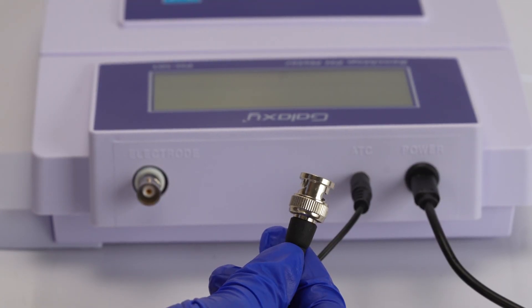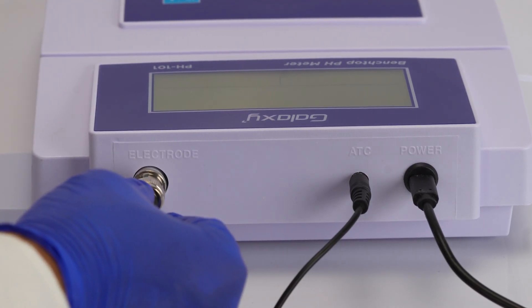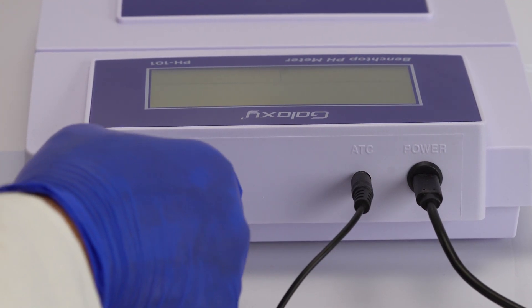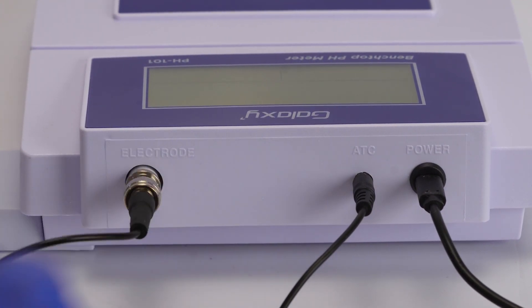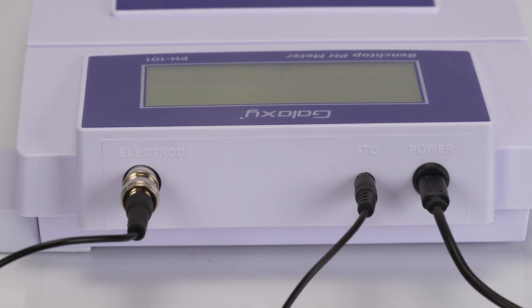Next, take the pH electrode and insert the BNC connector into the socket labeled electrode. Rotate it clockwise until it locks in place. Remember, don't pull on the cable afterward.